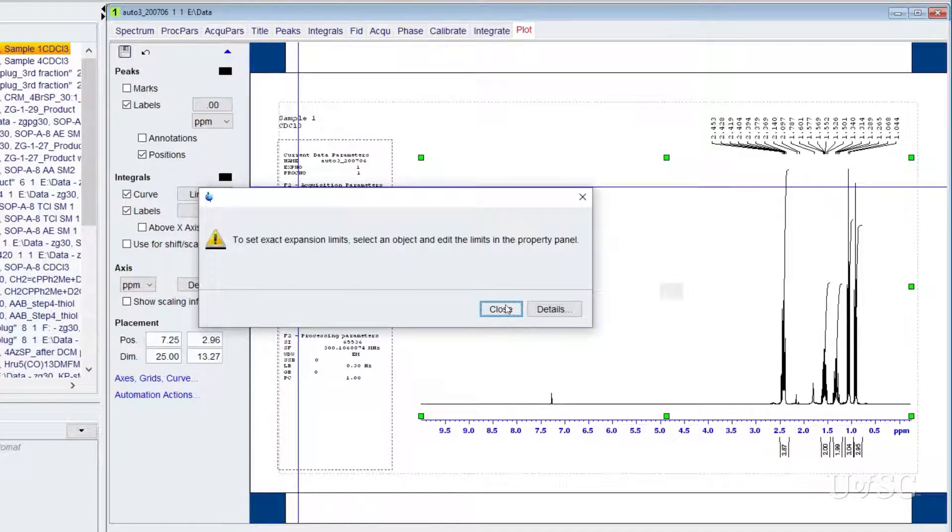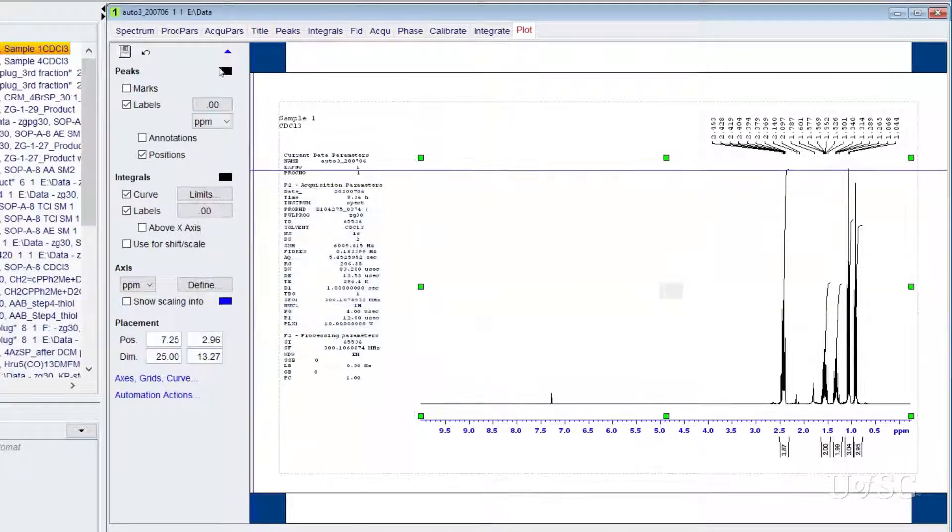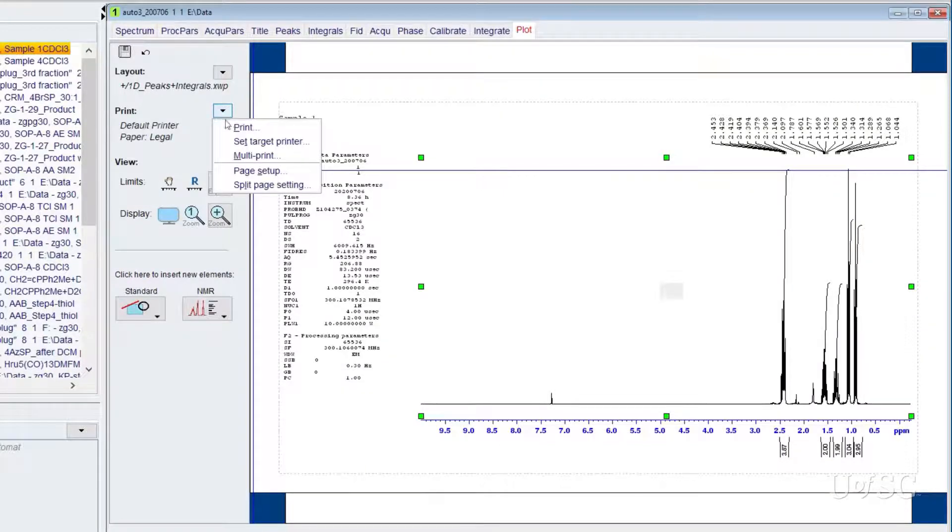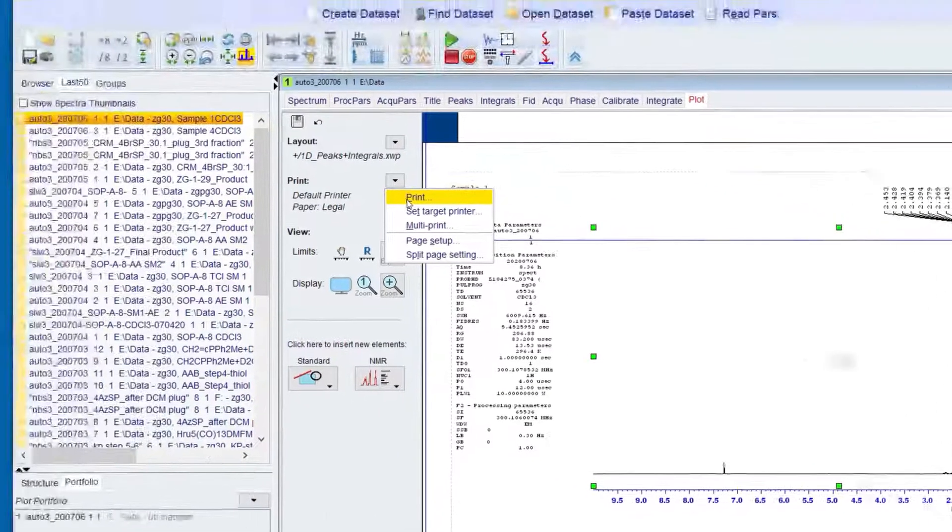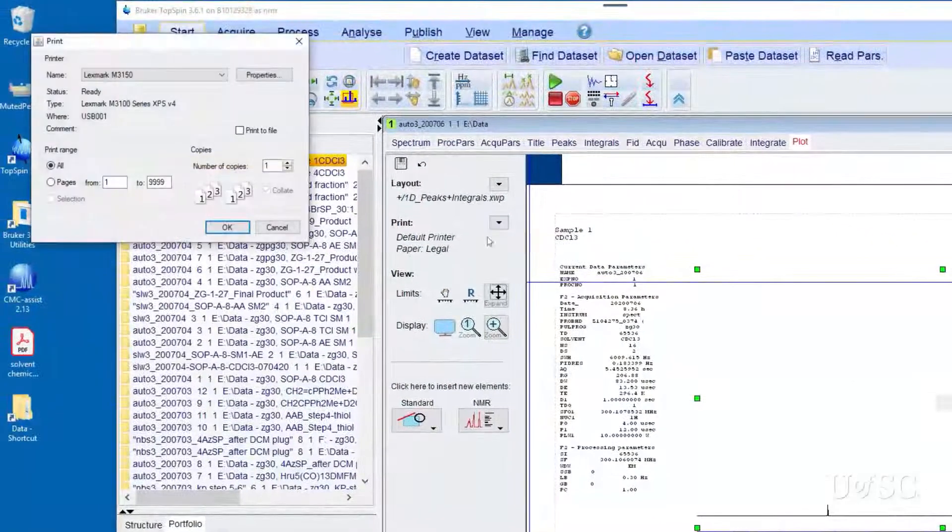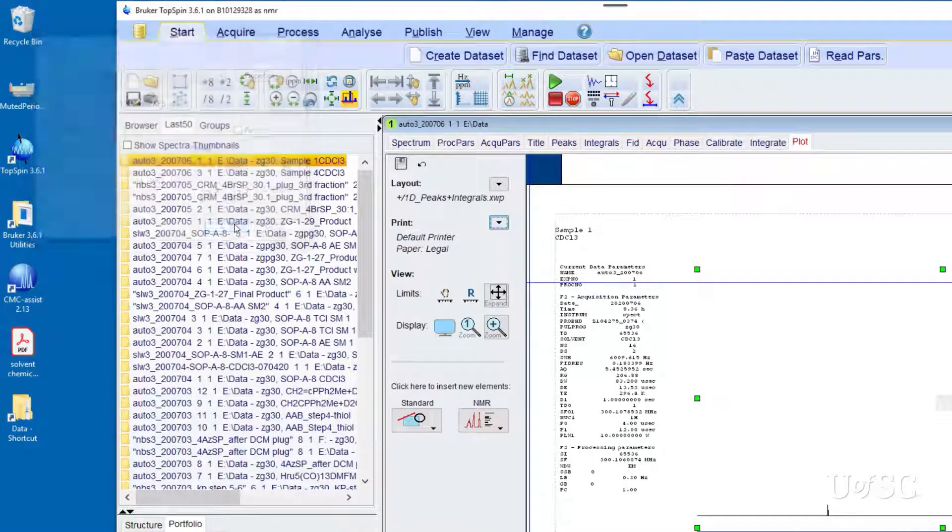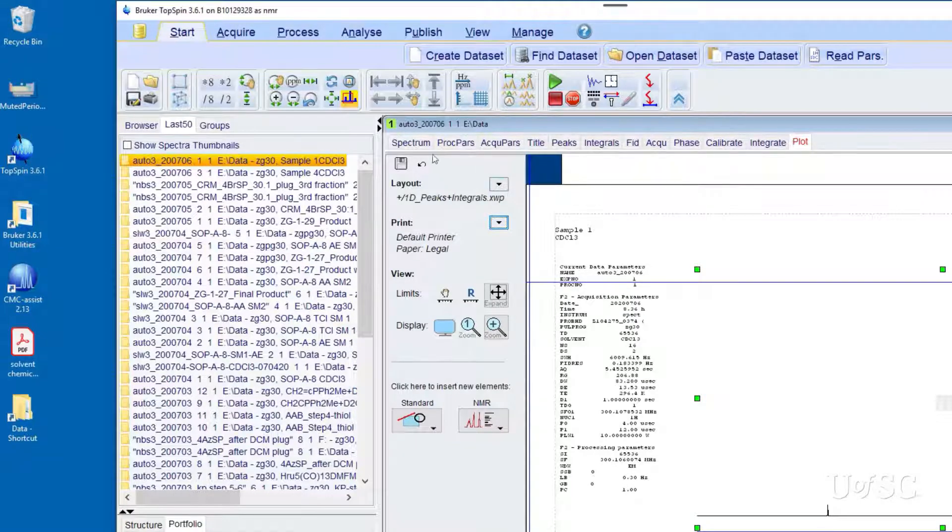When you are happy with the appearance you can send the output to the printer by clicking on the downward pointing triangle next to the print label, and choose print. Then click OK on the dialog box that comes up.